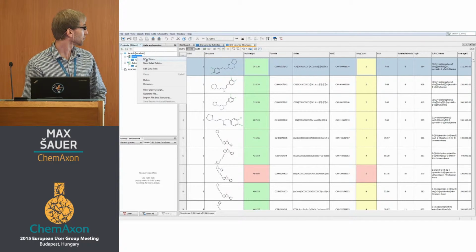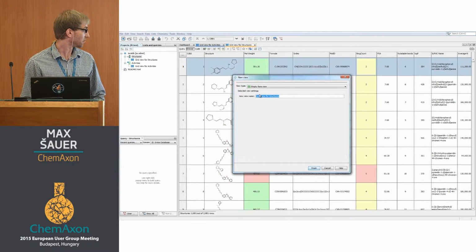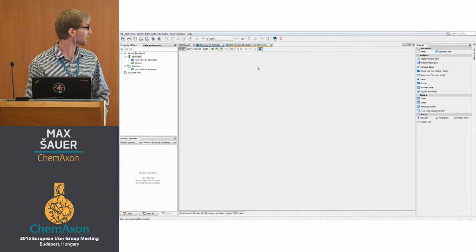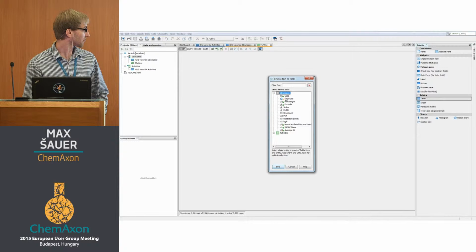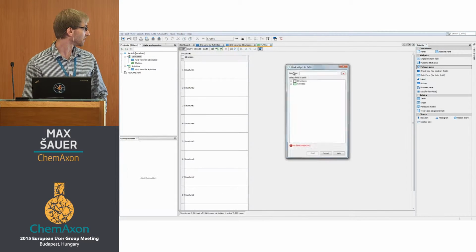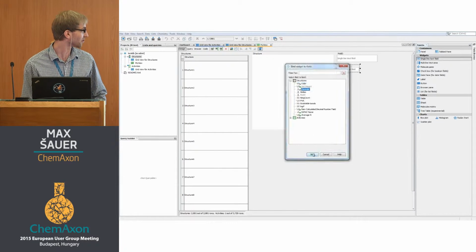The next thing I will show you is the form designing. It's quite a lengthy process, so let me do a little cheat. As you can see, in the design mode, you can add various widgets to your form. Because I'm not really that quick at showing you the form building here, we have sped it up a little bit, so I hope you don't mind.